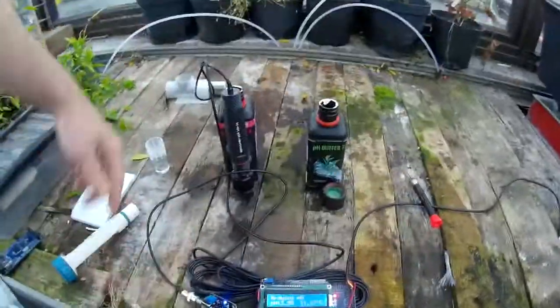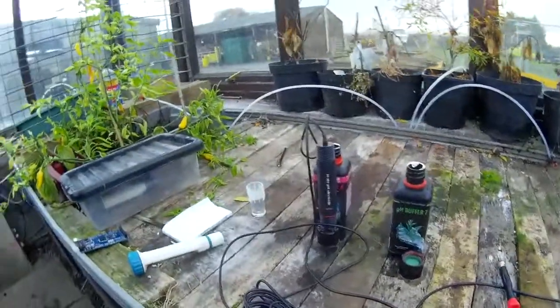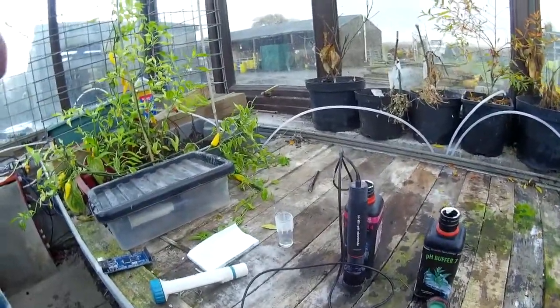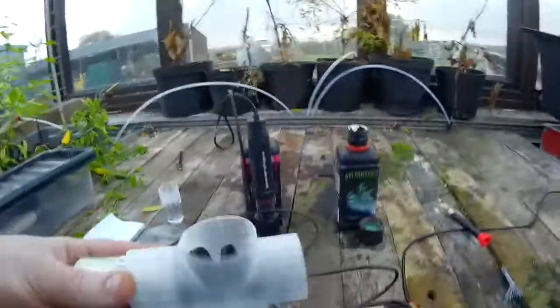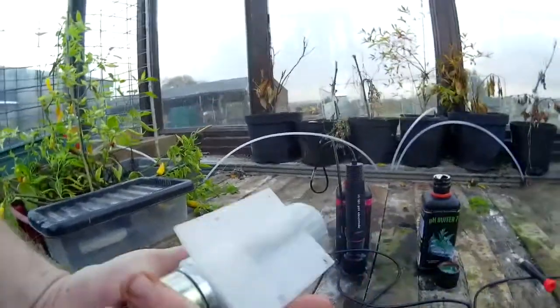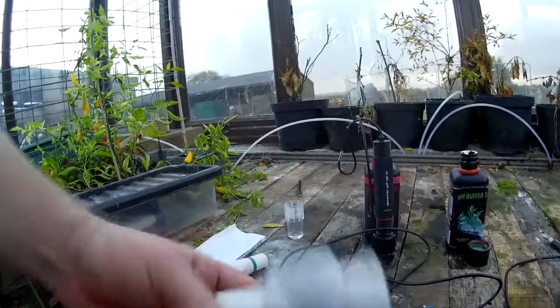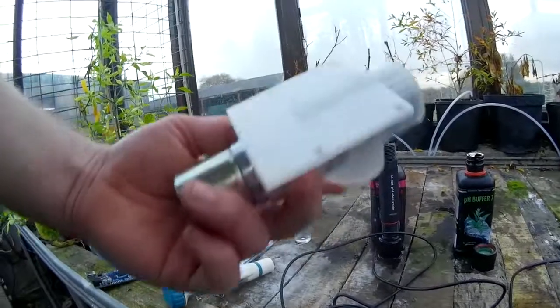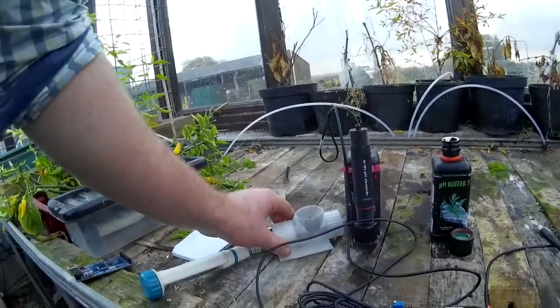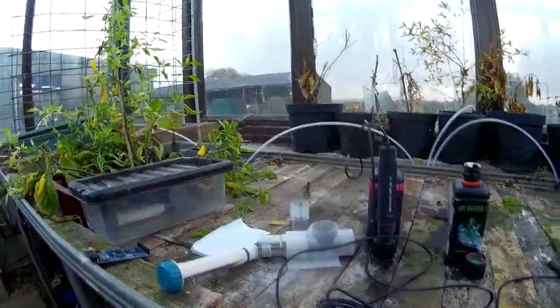This setup — this probe and this LCD — is what we're going to be using in the next part where we automate the pH controller. This here is an auger for delivering pH powder; it's a 3D-printed one. I'll release the designs for this soon — it was me and Paulo of Aquaponics Lab that built this. It's still going through testing, but as soon as it's finished we'll upload the pH control code and the code for that. So keep watching.